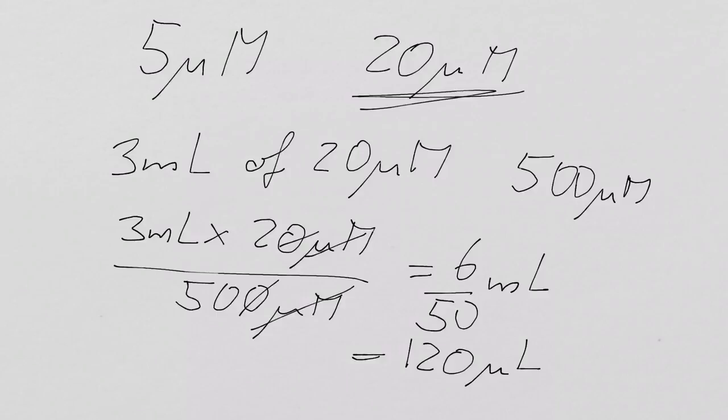So 120 microliters, and you have to fill it up with water to get the 3 milliliters, and you do that 3 times, and measure that. Okay? Shouldn't take you too long. Any questions about that? Good stuff, hey?